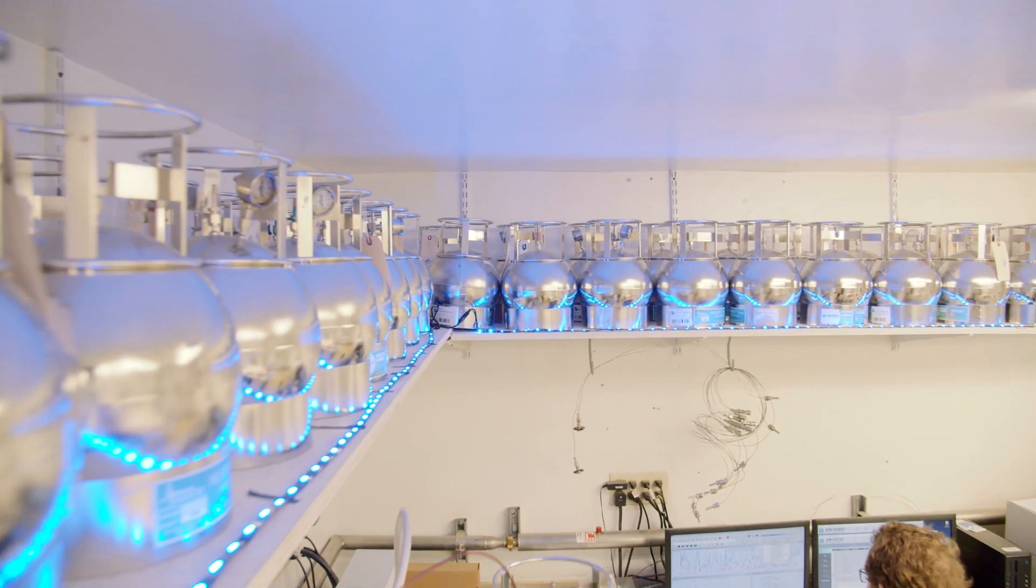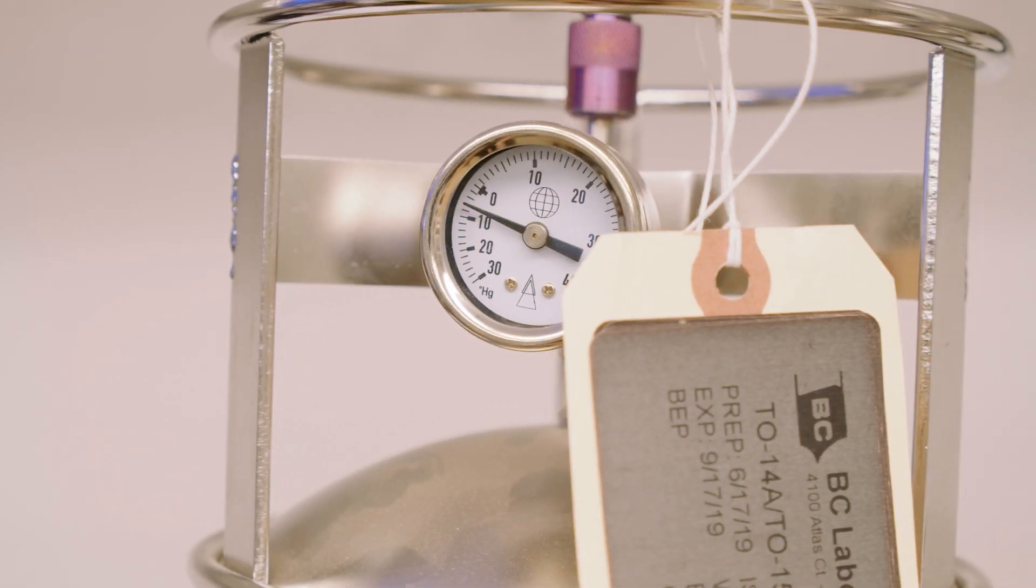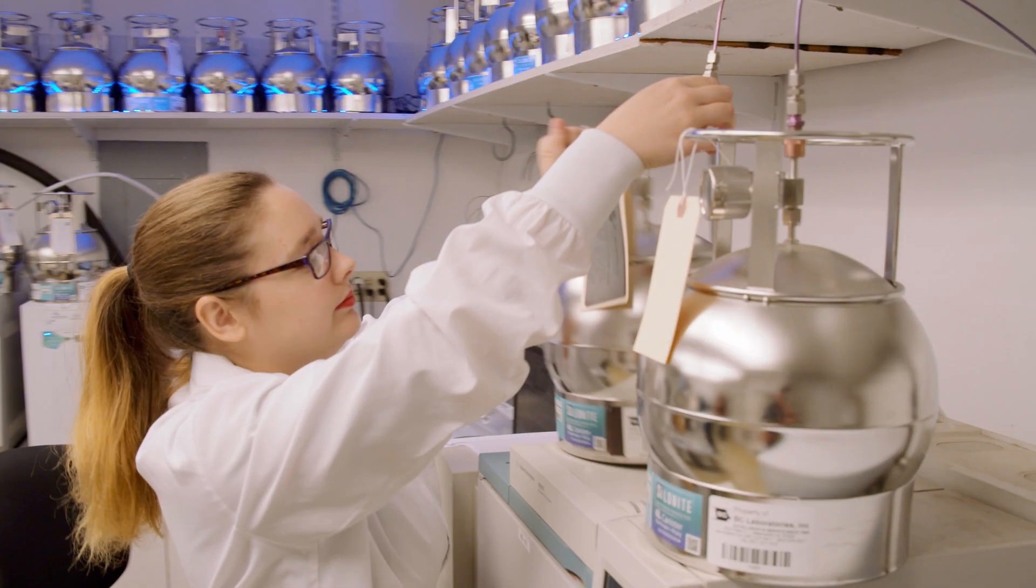Air samples have a shorter route to the vapor lab, and then to analysis for TO3, TO14, or TO15 tests.